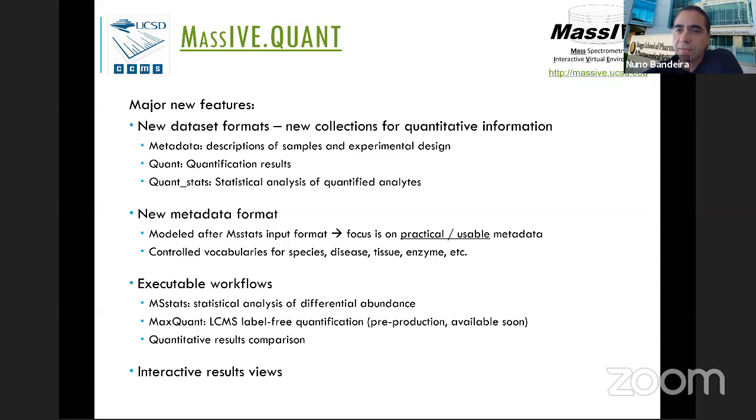There's a question: it can be difficult to get an identification file for DIA data. How do we create a complete submission for DIA data sets? So this is a good question. How do we do this for DIA data? We actually have been able to do this in two different ways.